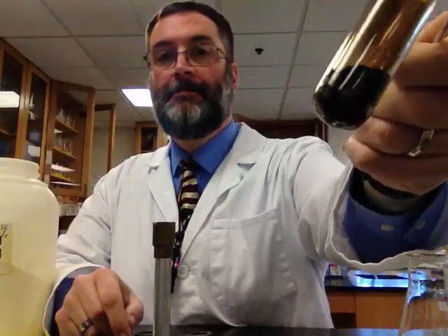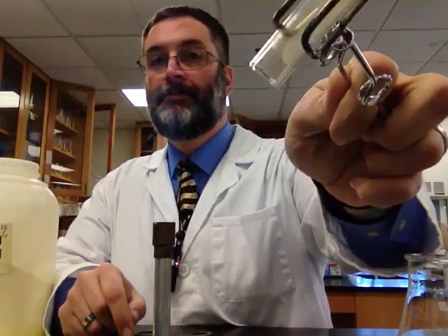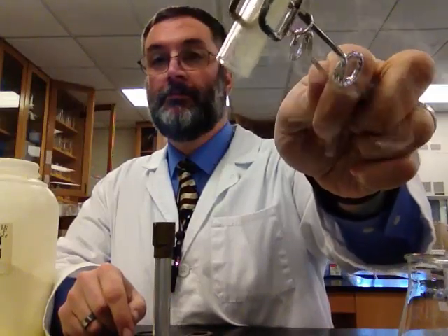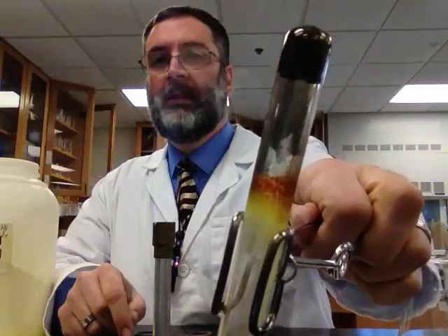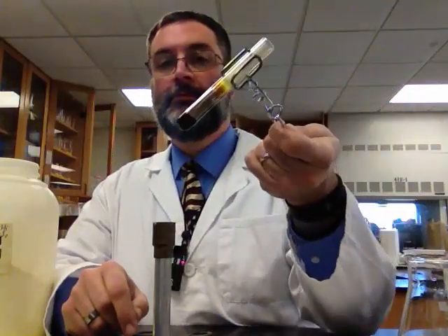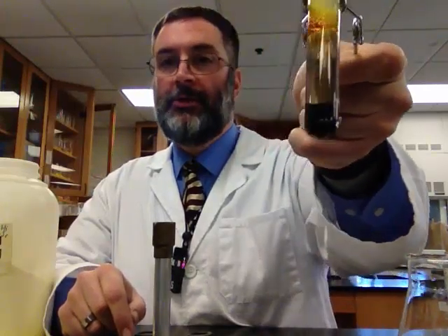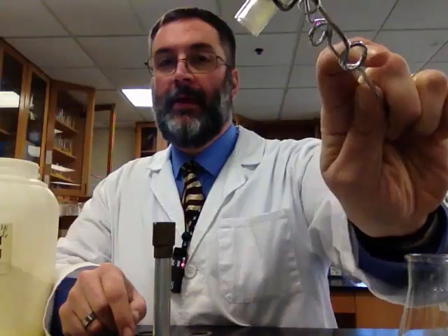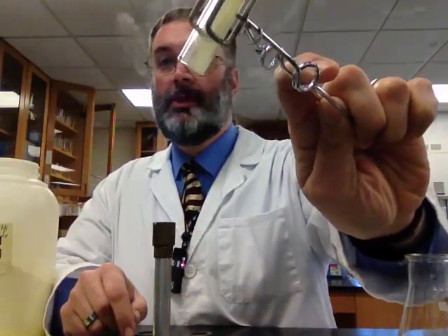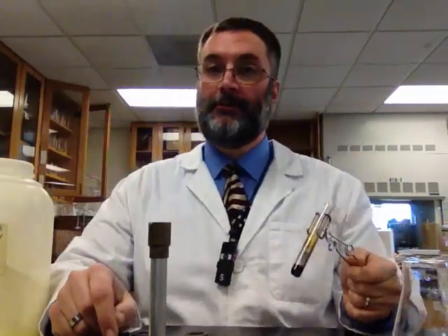You see that? Looks a little different now, doesn't it? It's also no longer a powder. Pretty clear color change. We had that smoke produced. Everything looks very different than when we started.